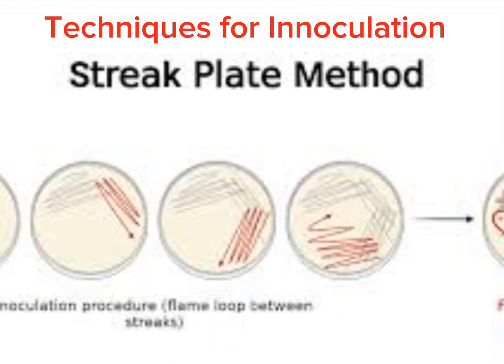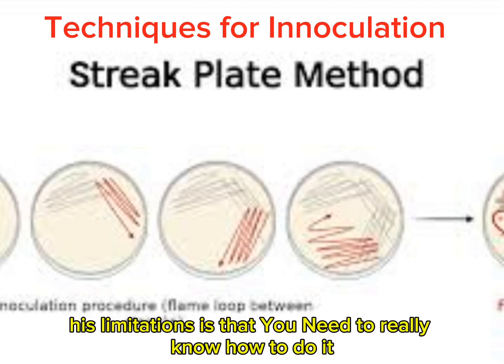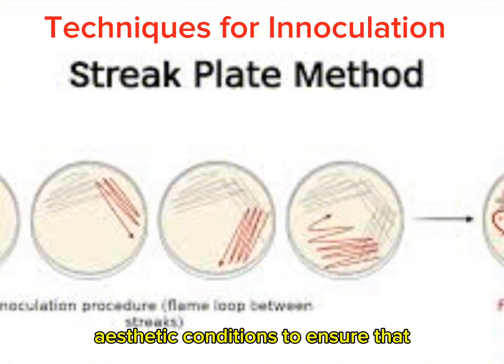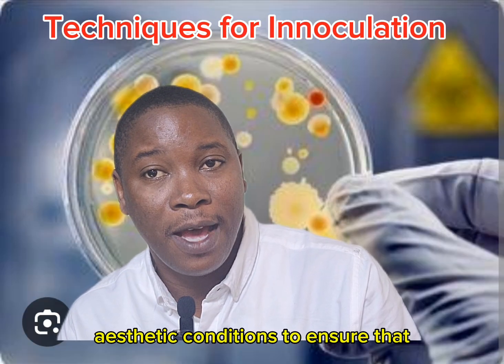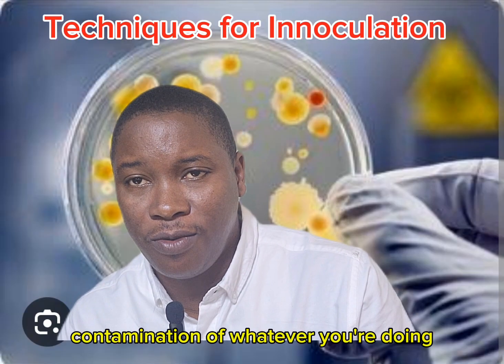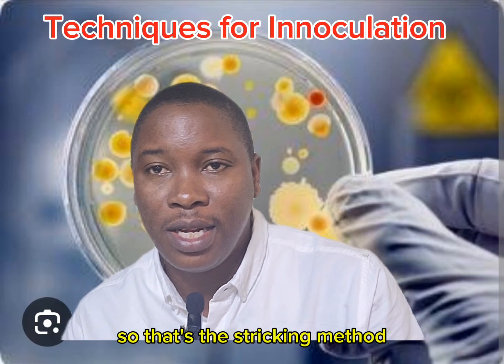Its limitation is that you need to really know how to do it. You need to do it under very good aseptic conditions to ensure that you don't have contamination of whatever you're doing. So that's the streaking method.